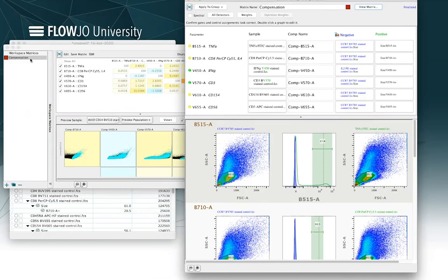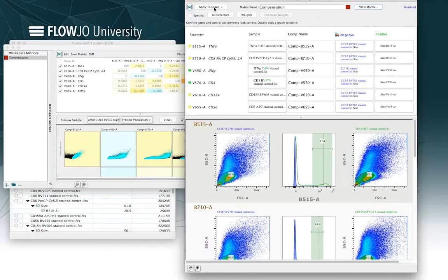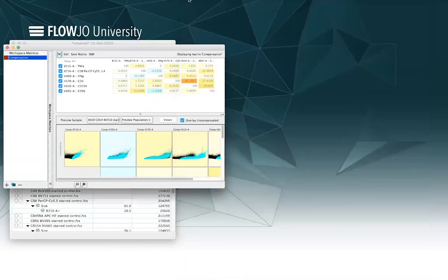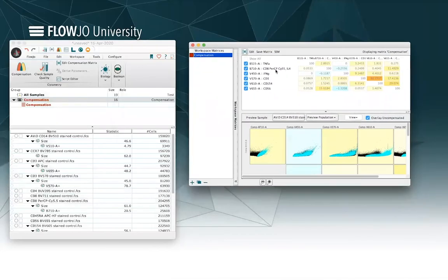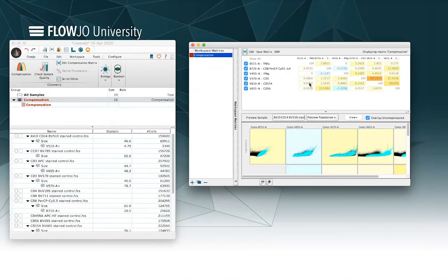For now I'm done with the wizard so I'll close out of that screen and we can look at the compensation that's been calculated for our single stain controls thus far. And in there you can see the various spillover percentages that was calculated for each color into each detector.